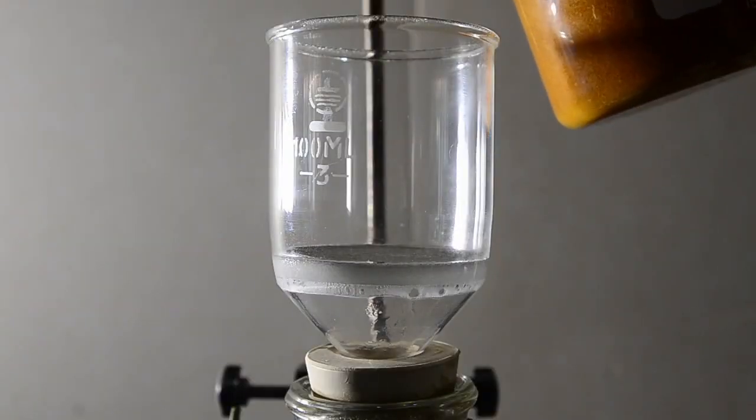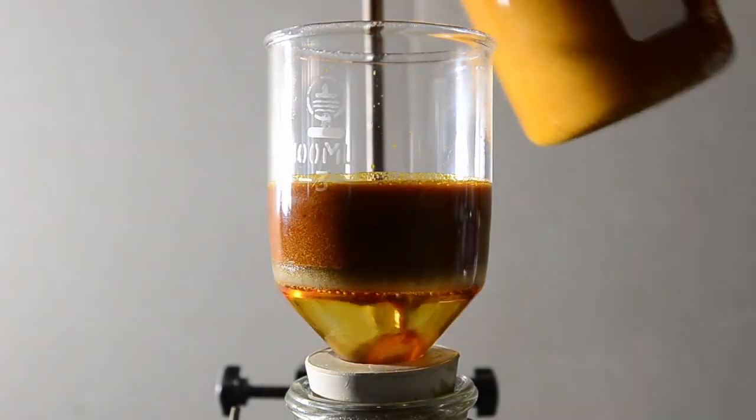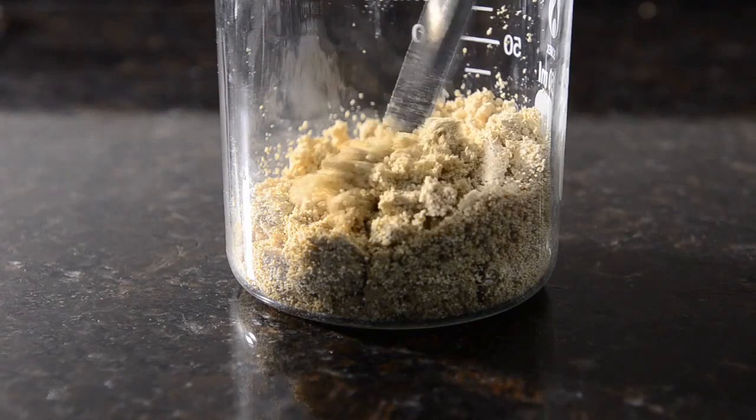Vacuum filter and dry the yellow solid, then wash with 50 ml of a very dilute sodium thiosulfate solution, followed by 50 ml of cold water. Dry the solid as much as you can on the filter, but be warned, this stuff doesn't like to dry. We then dry the damp tin-colored solid by putting it in a sealed container containing calcium chloride granules.